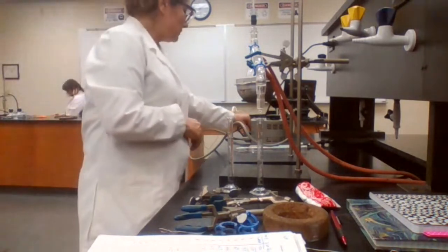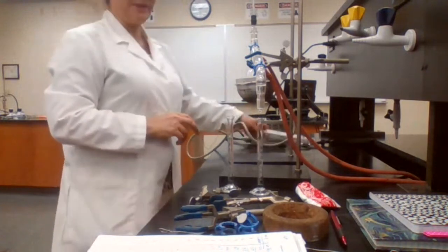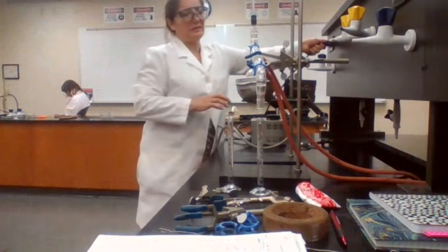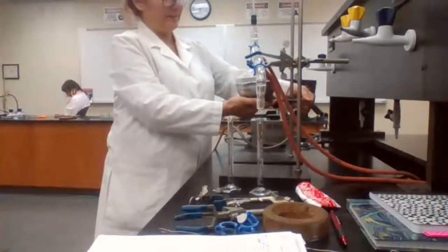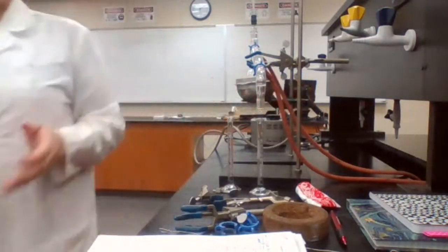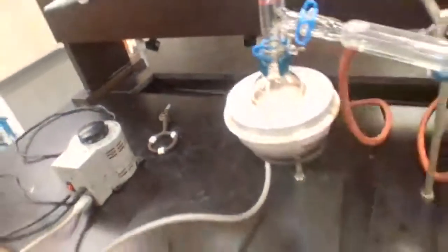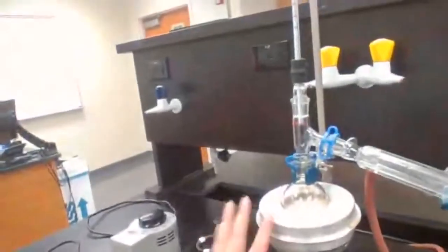Okay, I'm going to stop the distillation. So I said, to stop the distillation, you need to first turn off the power regulator, unplug the power regulator, lower the heating mantle, because even though I turned off the power regulator and then I unplugged it, this is still boiling, see? Because the heating mantle is still hot. So if I want to stop the distillation, actually, I have to drop down the heating mantle.